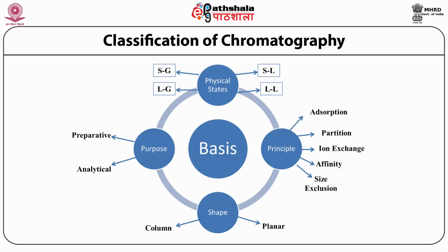When sample consisting a mixture of proteins is passed through the column, only the specific antigen is bound to the antibody immobilized on the stationary phase. This antigen can be extracted either by changing the ionic strength or pH or through dialysis.